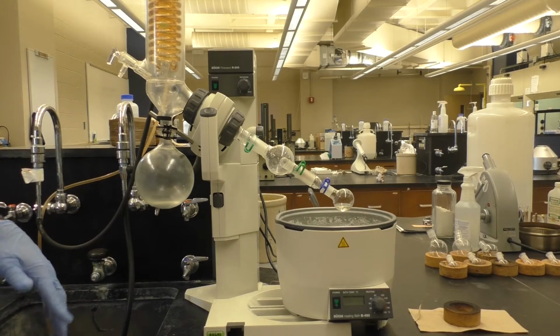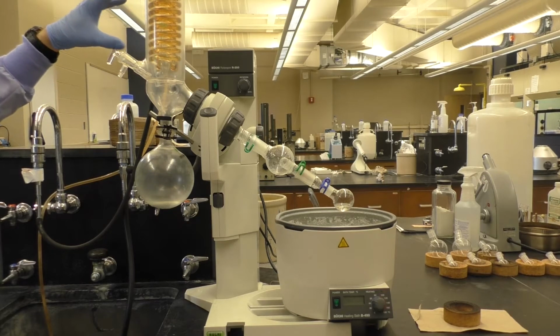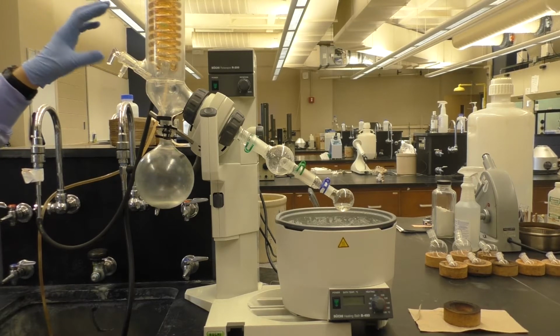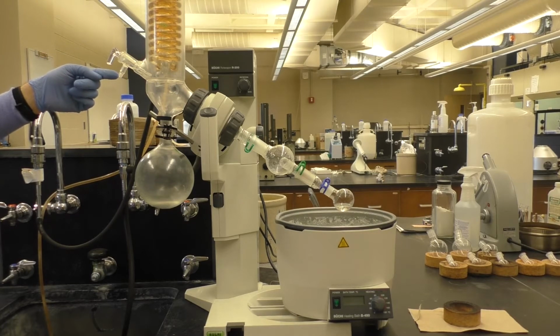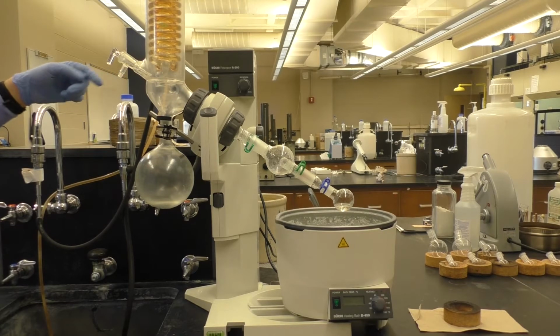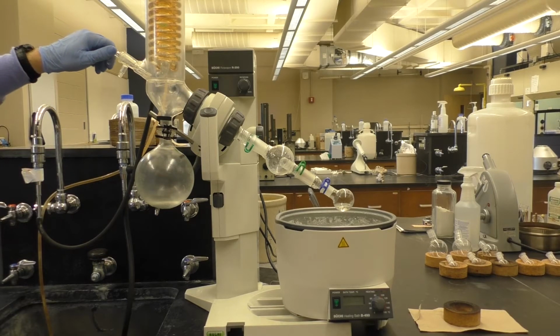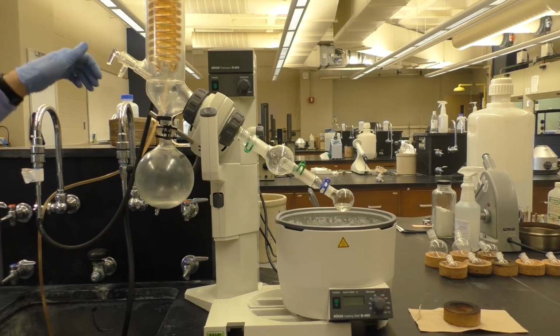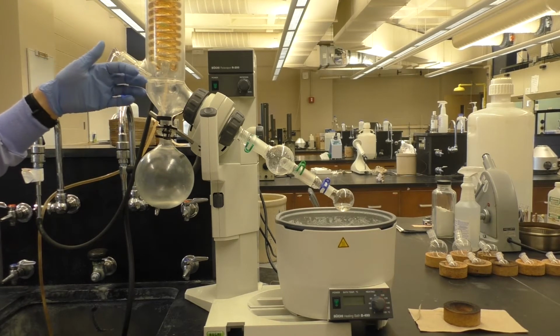And then a couple other things before I turn the vacuum on. When I first turn the water aspirator on, it will pull a vacuum, but this valve right here is open to the atmosphere, and so the system won't really be under much vacuum. At first it'll just suck air through here, which you might be able to hear as a hissing or a whining noise. I'm going to close this off here after I've turned on the vacuum, and that will really then allow the system to pull a vacuum.